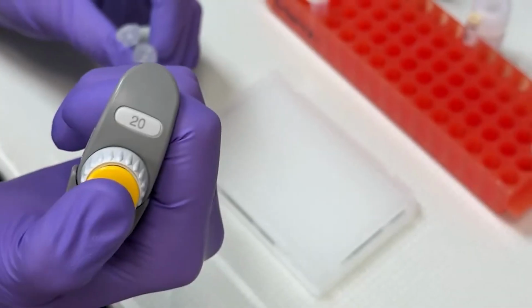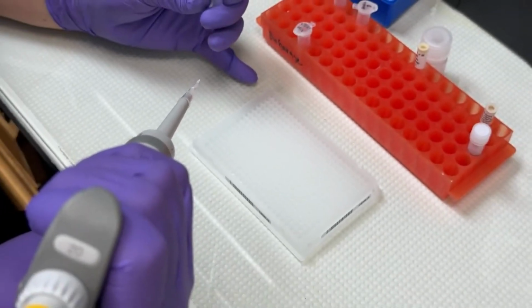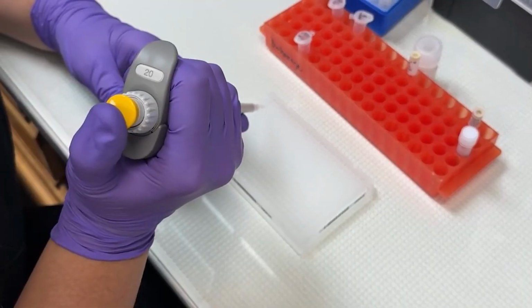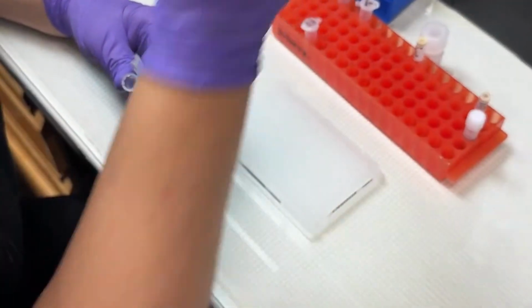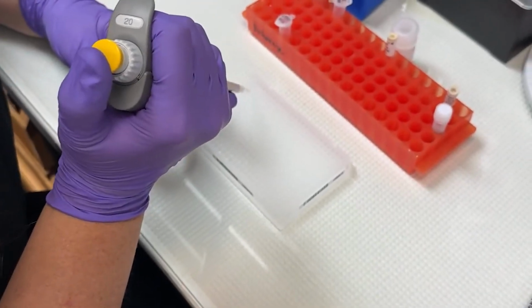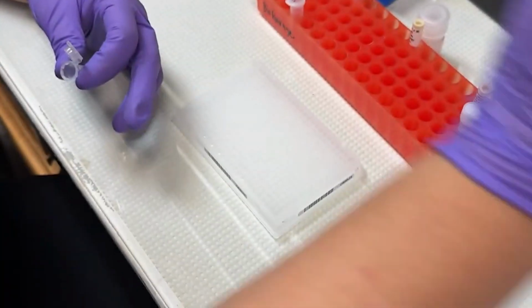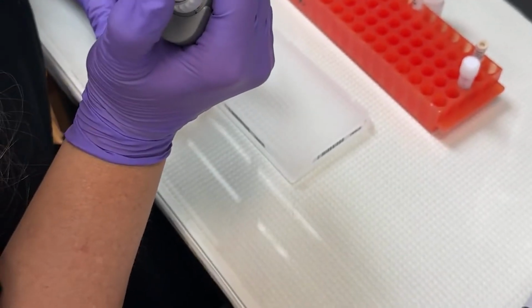And when this is all put in row A, I will put sample 1. In row C, I will put sample 2. In row E, sorry, try that again. In row E, I will put sample 3. And in G, I will put our no template control.